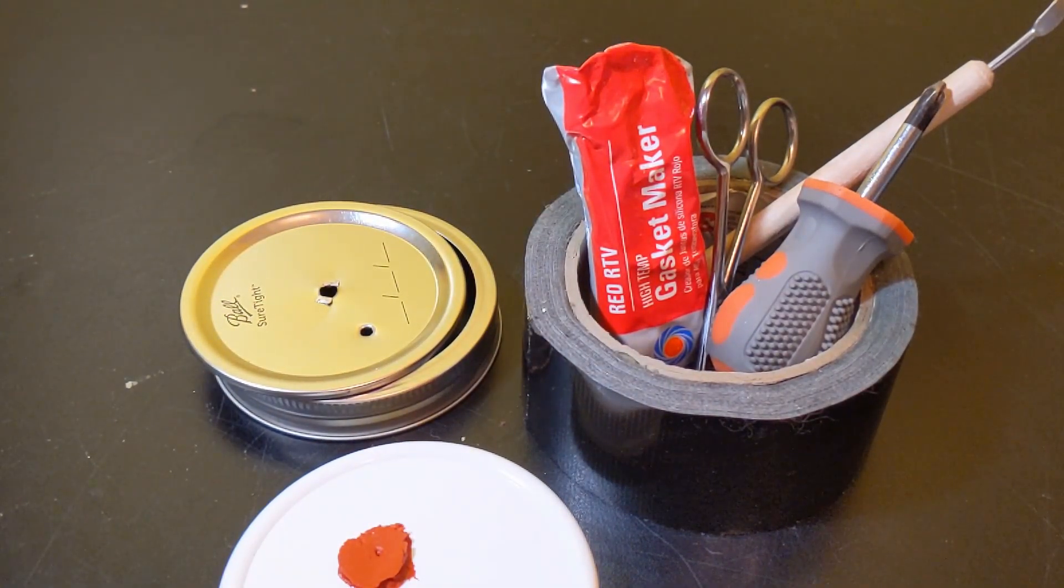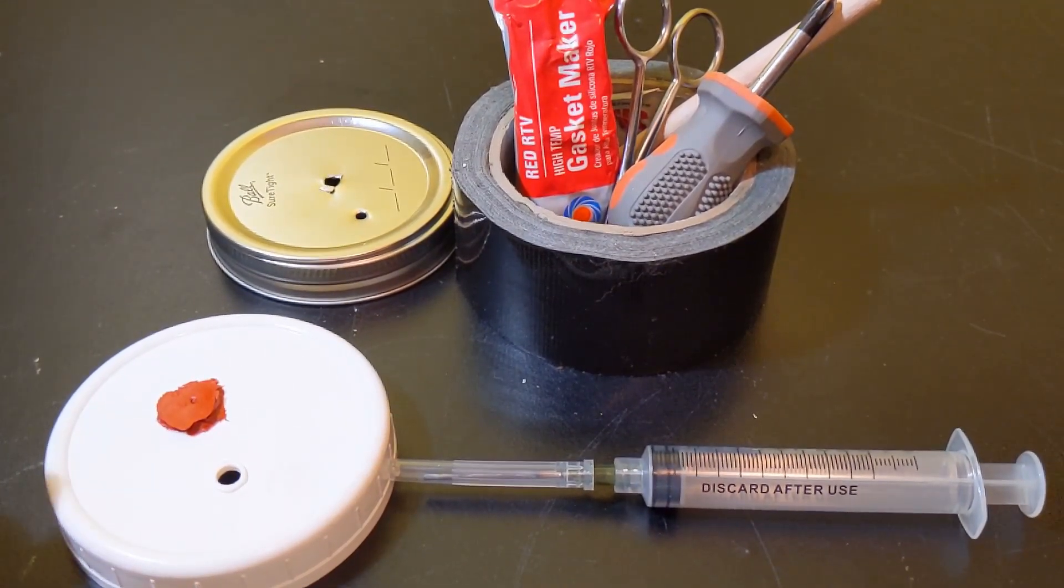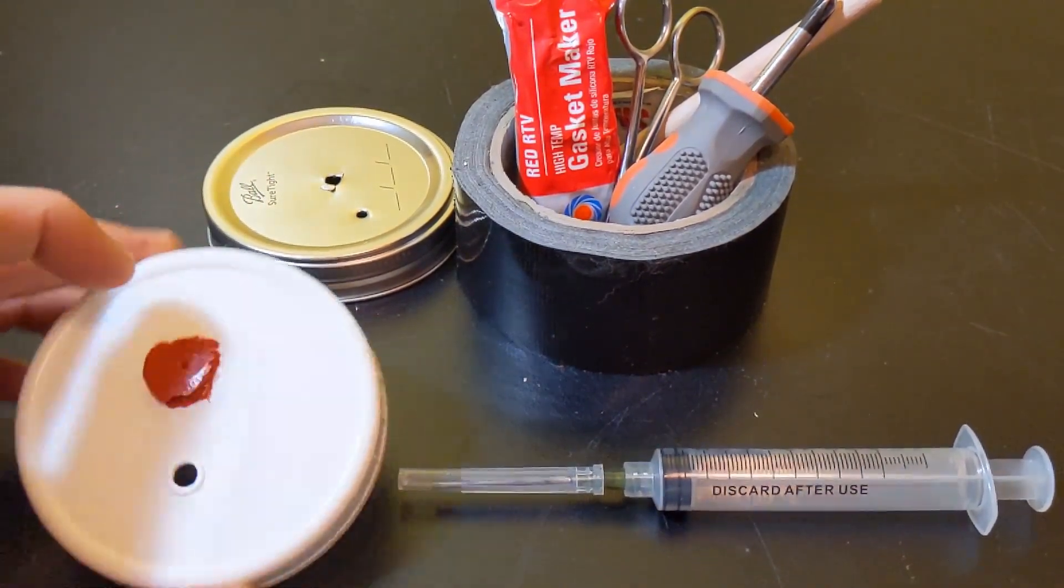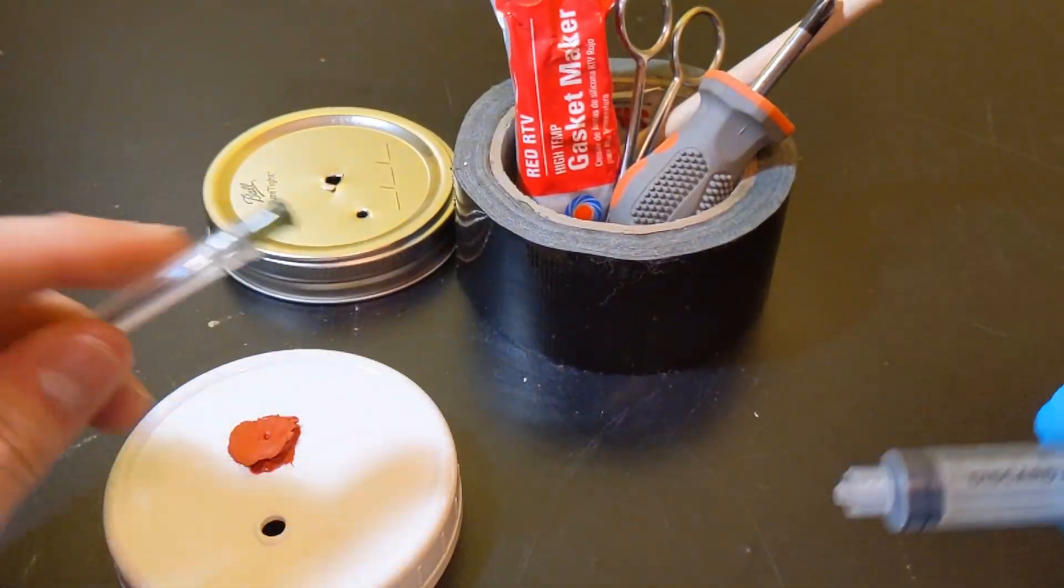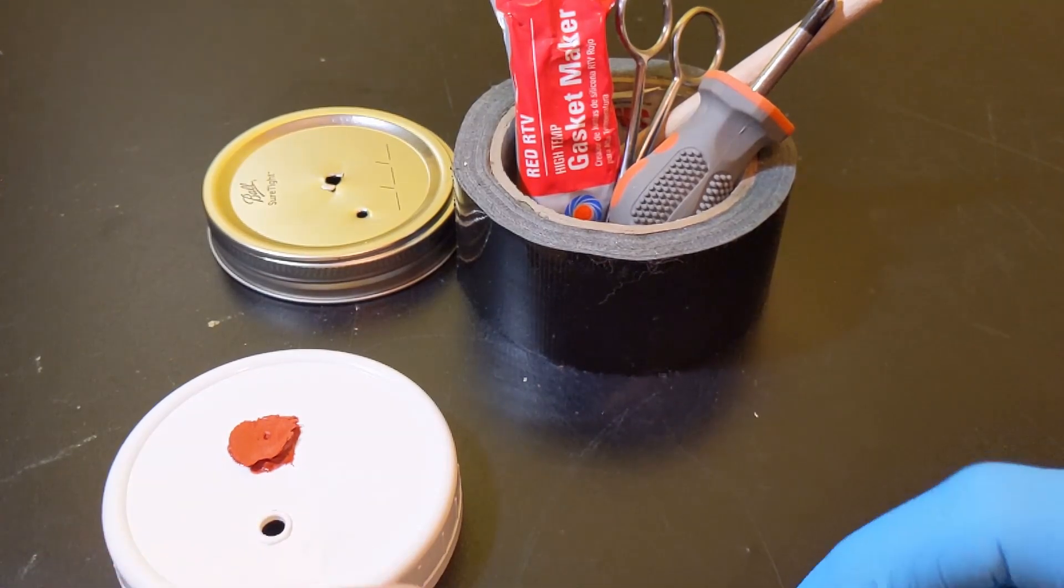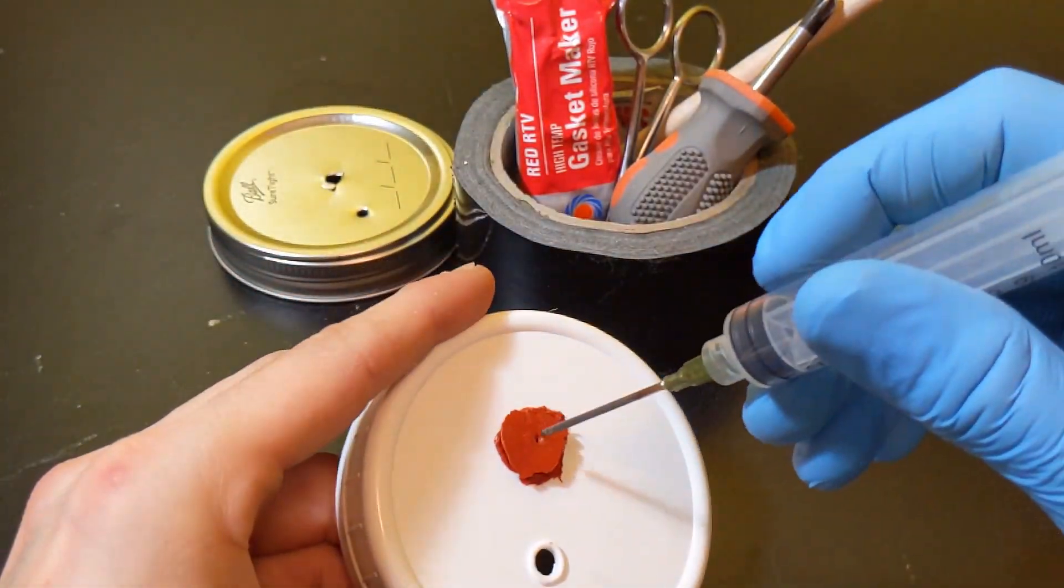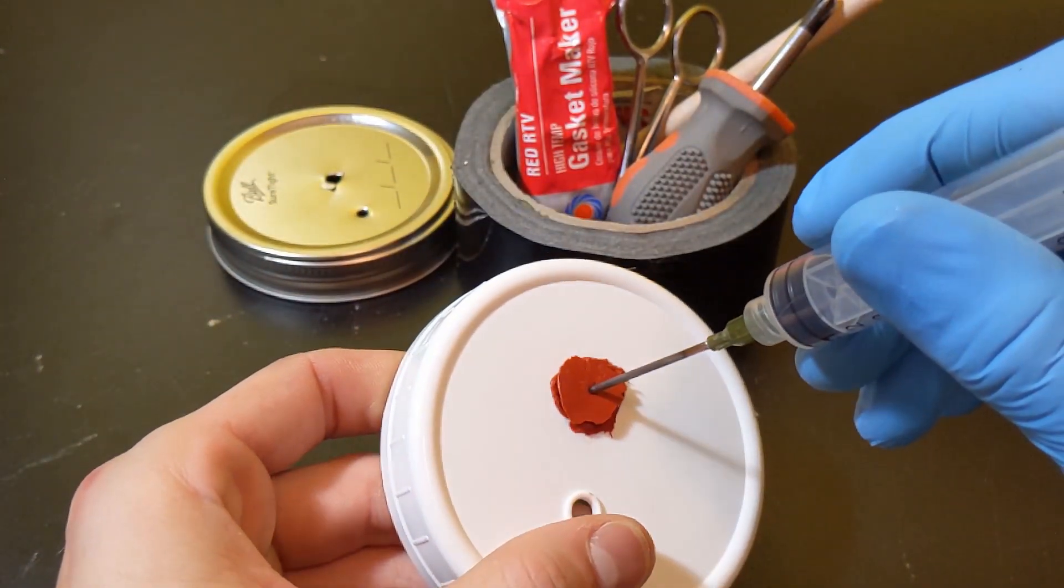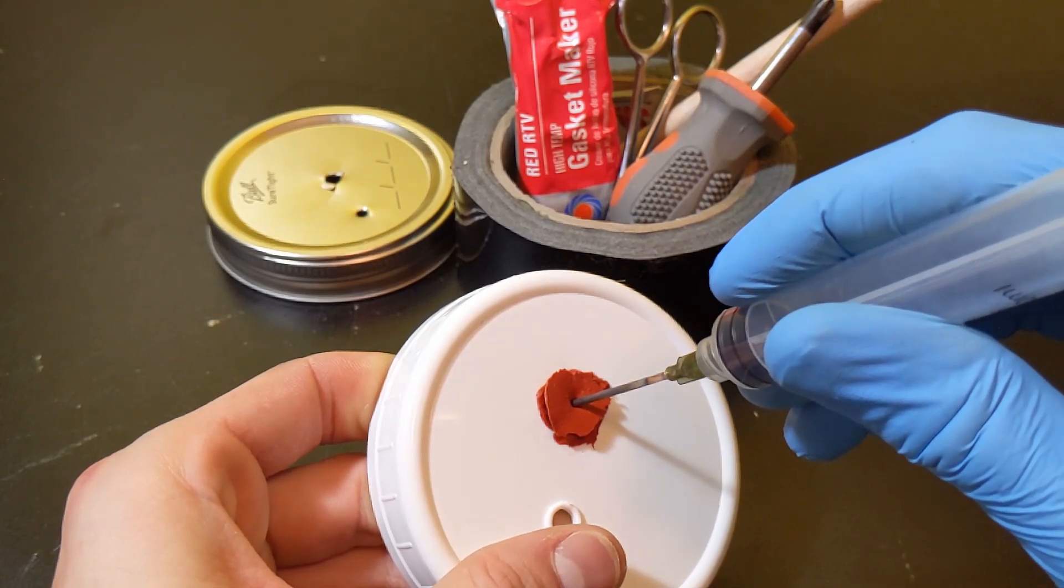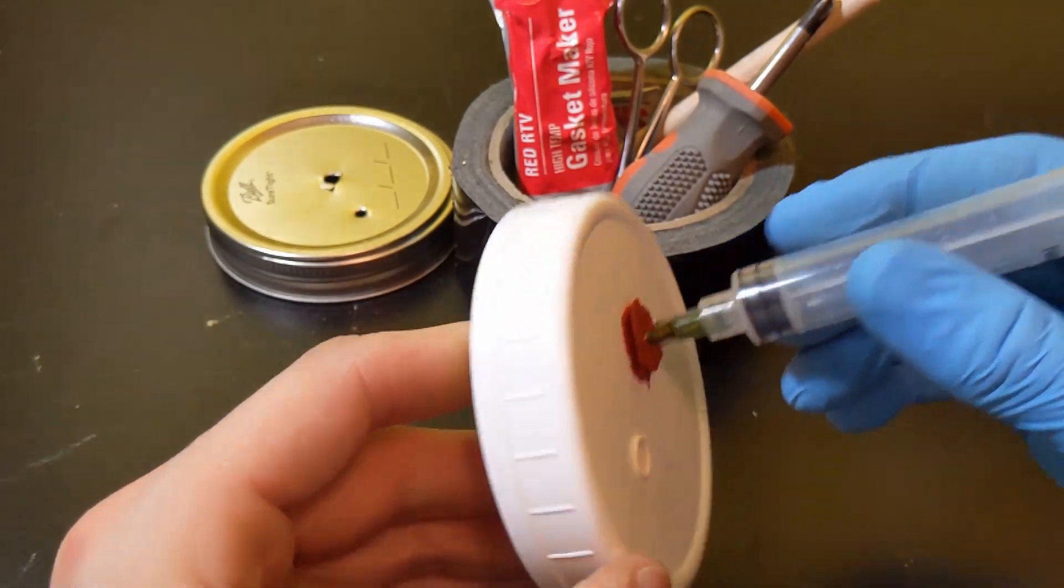Now what is an inoculation port? So in mycology when we introduce any kind of spores or cultures to a spawn, we have to be as sterile and as clean as we can because anytime we have contact with the outside environment and the inside of either the jar we're using, we're exposing the grains to contamination or possible contamination.